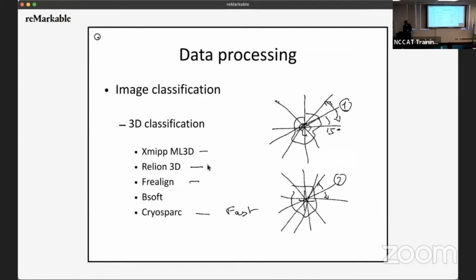It's like basically 2 was kind of happy, 1 was kind of happy, but none of them actually had the right orientation parameter, because they both would have wanted to be maybe here. And so therefore the choice was made badly. So what you really need to be careful about is to go to an angular range where you can actually make the discrimination between two conformations.